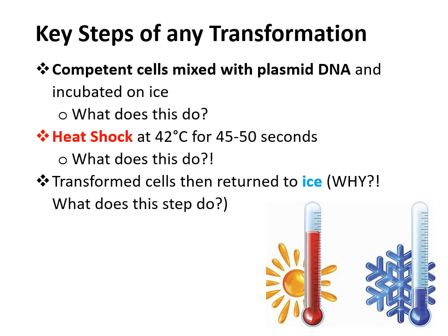You then quickly return those bacterial cells to ice. Now think about it. Why would you want to do that? Well, you don't want those pores, those holes, staying open forever, right? So the point of the ice, now that you hopefully have the plasmid DNA in the bacteria because of the heat shock step, is to then close the pores.